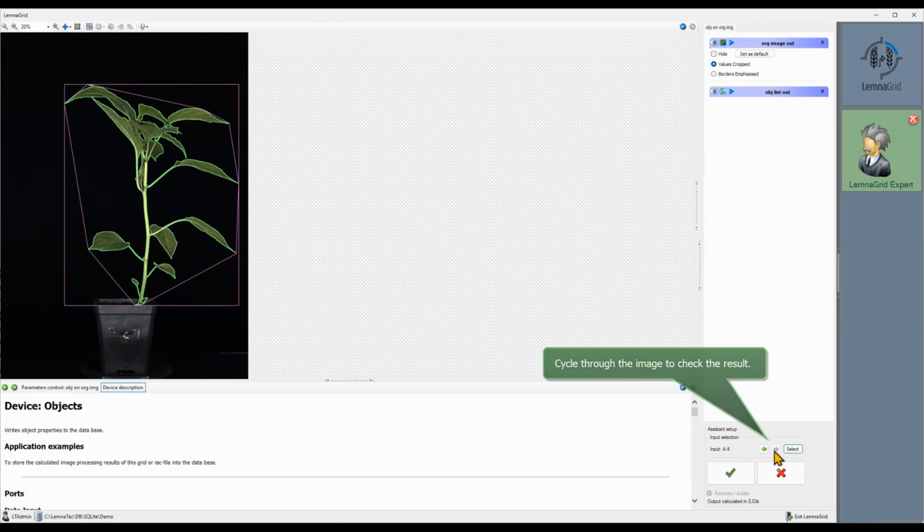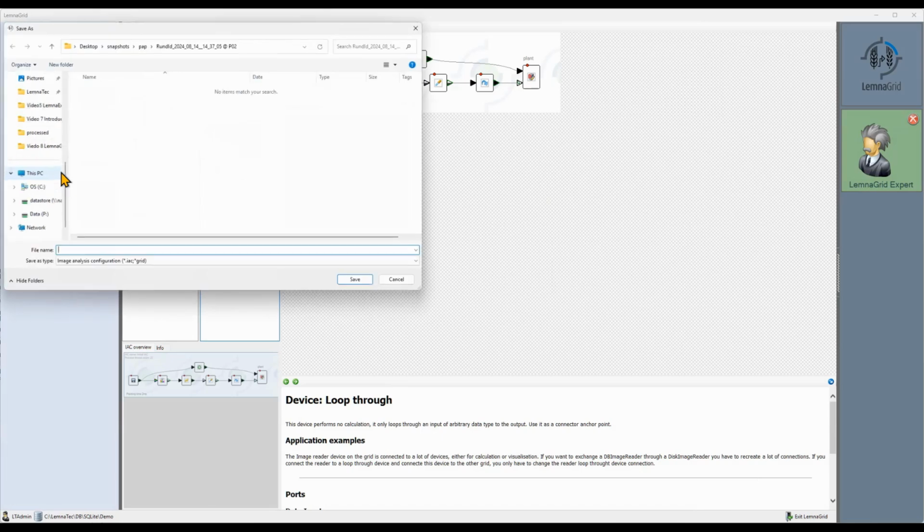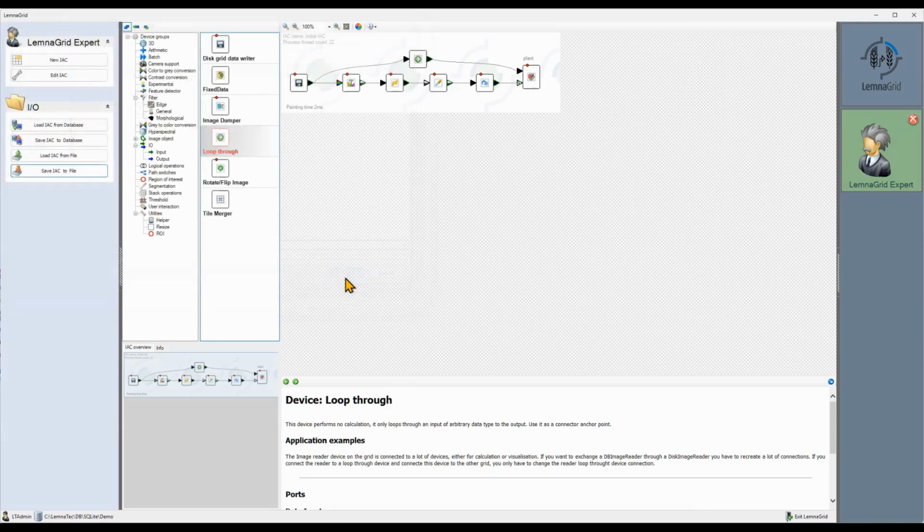This looks really good, but I selected some easy images for our first analysis. But if you prepare your samples carefully, it can be that easy. However, 4 example images are still not a lot, but it's enough for this demonstration. Finally, we have to save this analysis to a file. And so we got our first basic analysis.